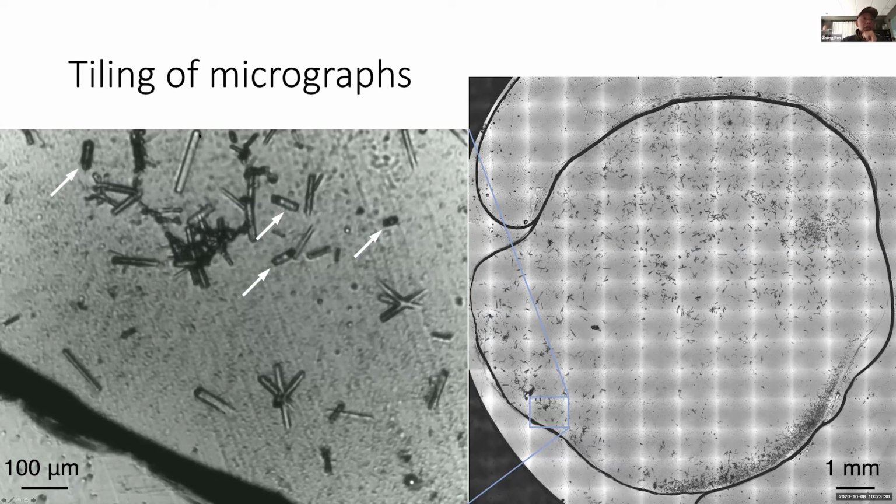And then you may recognize, oh, this is a good crystal and this is a good crystal. And then the arrow points at those short crystals. These crystals are actually more standing up than the good crystal you can recognize. The reason why they are good is because they change the orientation. Otherwise, there will be all crystals laying on the floor. And those standing up crystals are more precious, and they help to fill the reciprocal space.